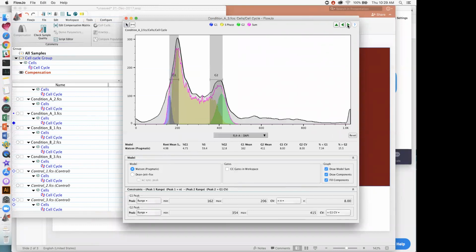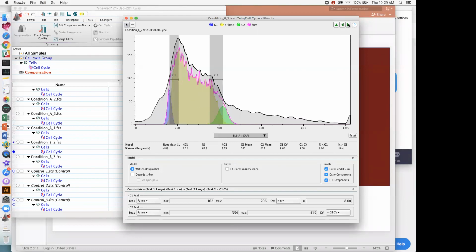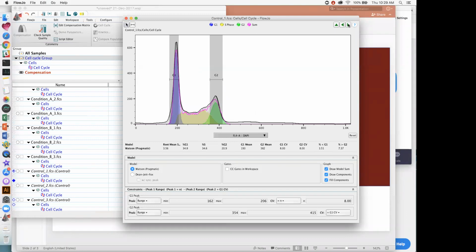What is the effect of narrowing that range on the rest of our samples? Again, here it appears that the peak is pushed off towards the left. It's not going to that high value that we have here off towards the right in the shaded area. Okay, and how does it compare, more importantly, with our controls? You see how our control peak here is a little bit off towards the left.